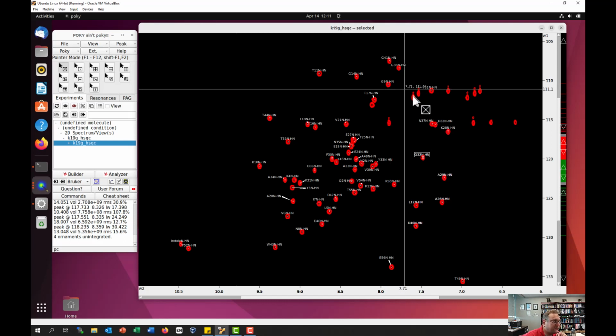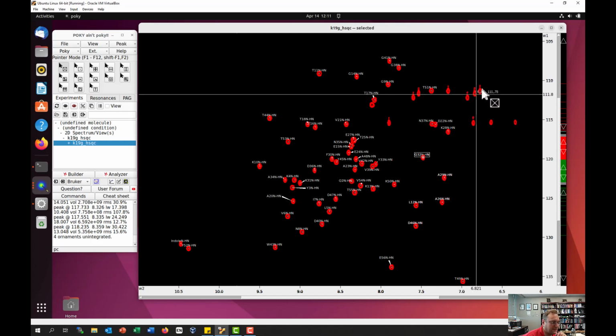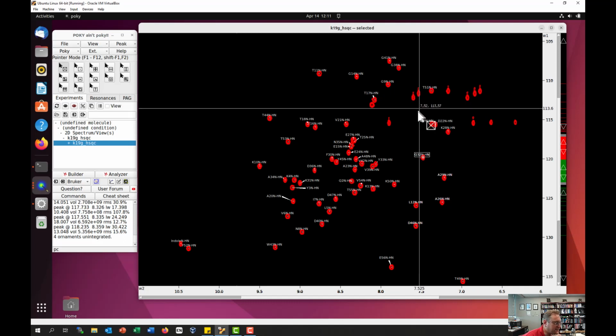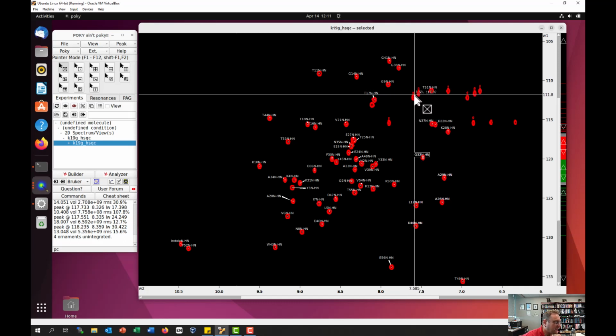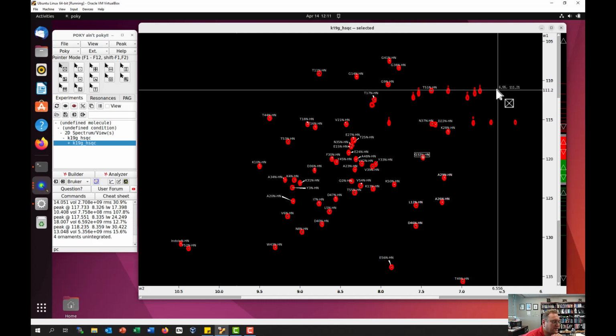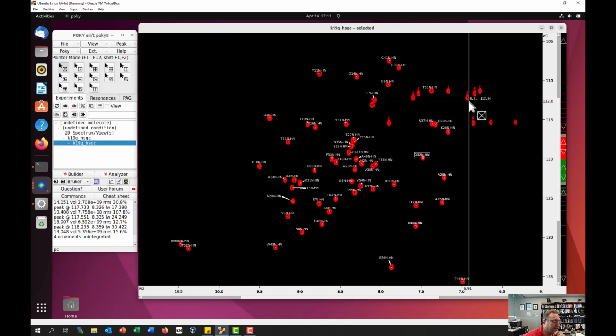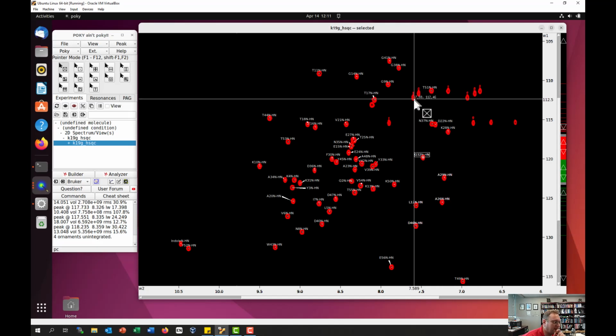So first of all, I mentioned that these peaks are asparagine peaks, NH2s. You don't see every asparagine in a protein generally because they're often surface exposed and the hydrogen exchange on those NHs is occasionally pretty fast, so you often don't see them.